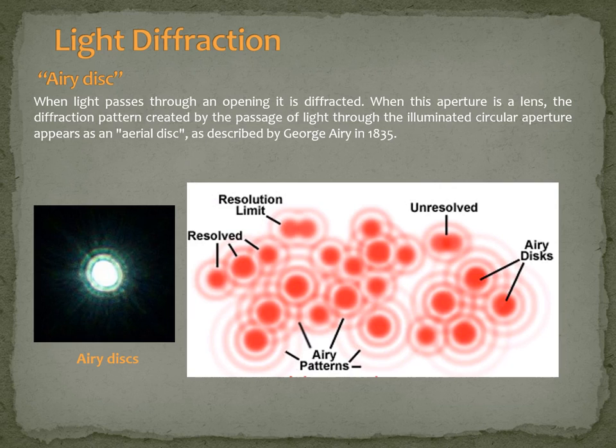So what are the implications? The implication is, as the wave passes through an opening, like in here, if this could be one lens and light coming through the lens, when the light bends around the corners of the lens, it will diffract and will create a diffraction pattern.